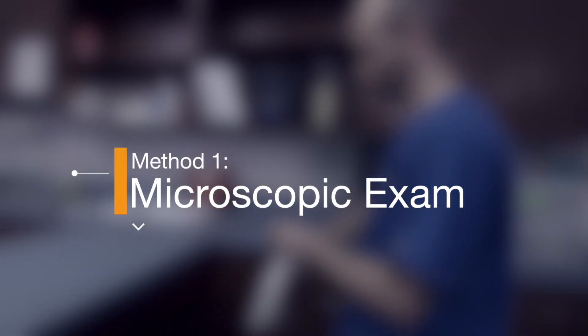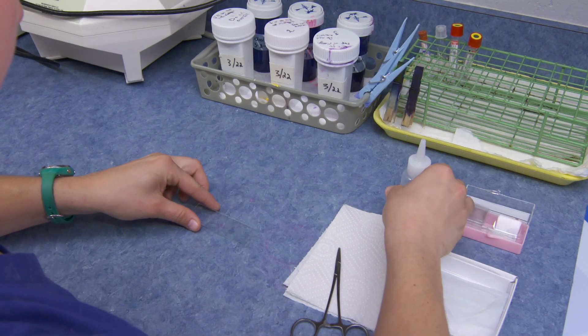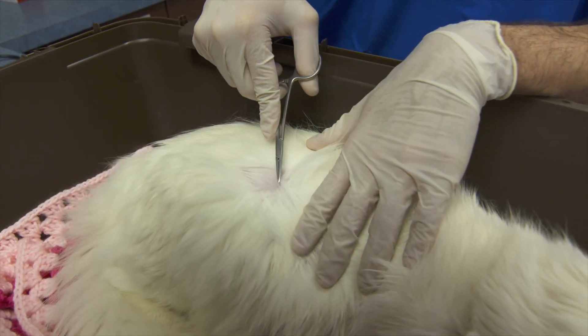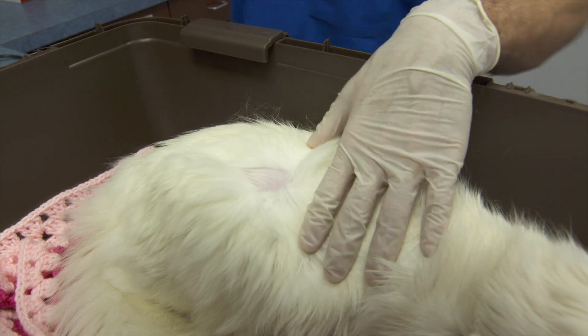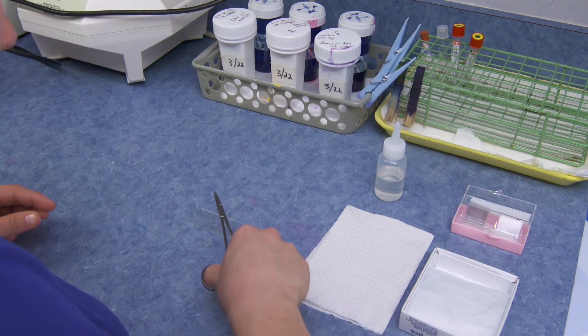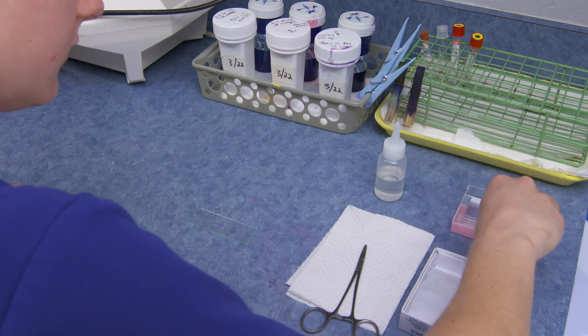Method 1: Microscopic Examination. Prepare a clean microscope slide with a drop of mineral oil. Identify hairs that fluoresce under Wood's lamp examination, and using a clean pair of forceps, gently pluck the hairs in the direction of growth. Place the plucked hairs into the mineral oil and examine the slide under a microscope using 4X magnification.